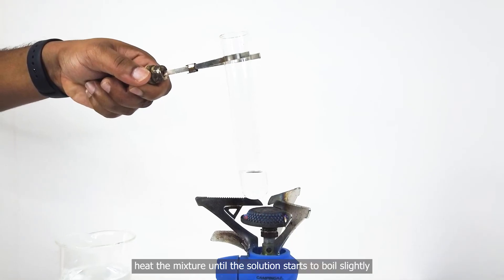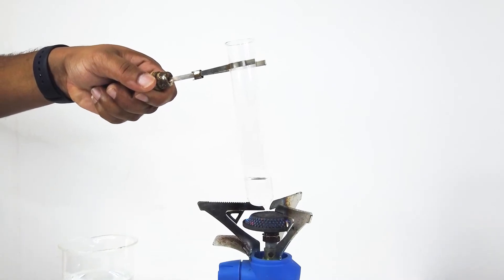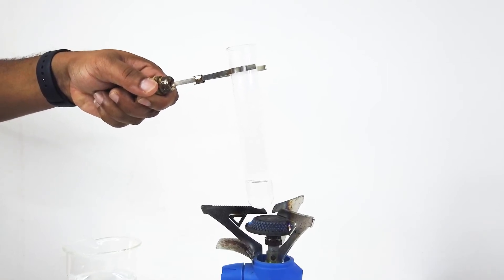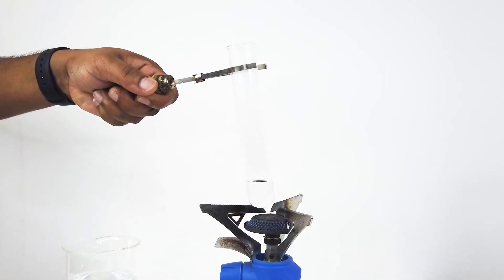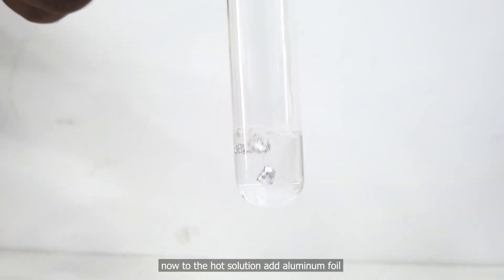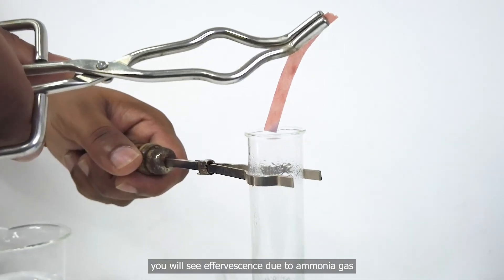Heat the mixture until the solution starts to boil slightly. Now, to the hot solution add aluminum foil. You will see effervescence due to ammonia gas.